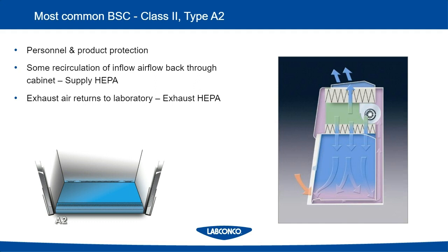Now, what happens in this situation if I have some chemicals that I would like to use that are fuming? Okay? There's two problems that exist with trying to use a fuming chemical in this type of cabinet. The first problem is that it's not going to be trapped by the HEPA filter and it's going to be pushed back into the laboratory.